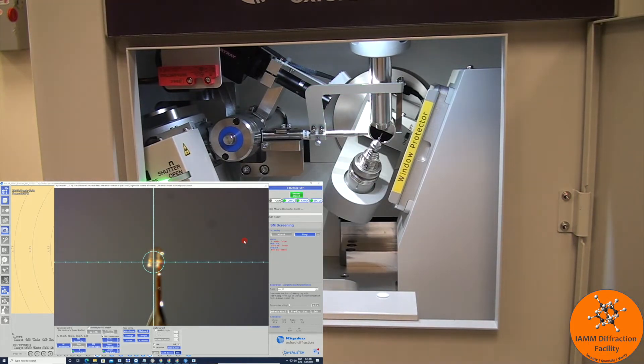Not perfect, but I'm not going to worry about perfect quite yet. At this point, we see that we are in the down position. We can either click this button or hit the left button on the keyboard, which will rotate the sample 90 degrees. We then need to make sure that it is aligned in this orientation.